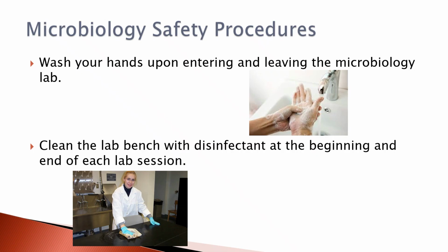We want to clean our lab bench with disinfectant at the beginning and the end of each lab session. I'll be talking a little bit later in the semester about the appropriate amount of time that different disinfectants have to be left on a surface. This is good information for your home too. But every product that you use to disinfect has instructions, and we really should probably read those instructions, because it tells you how long you need to leave the product on there. So the different products that we use in lab, the instructor would say, you need to spray the lab bench, and then you need to let this sit for 2 minutes or 1 minute or 5 minutes or whatever the instructions on the label say before you actually clean it up.